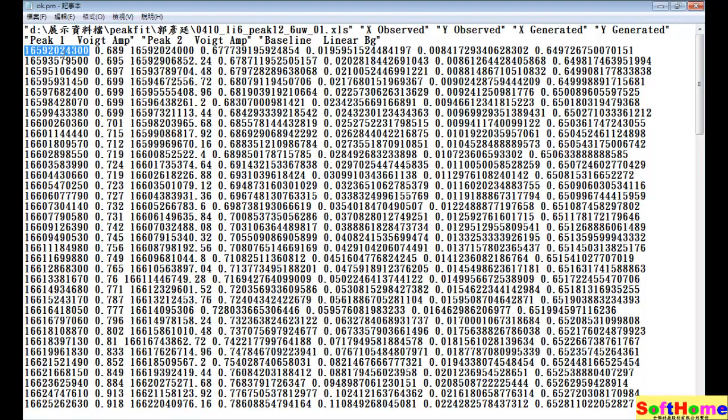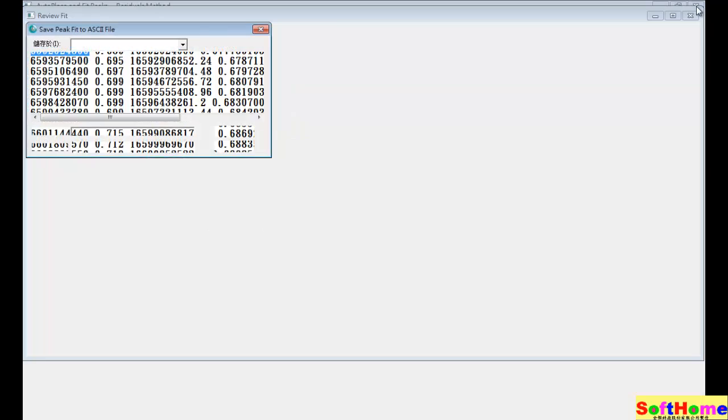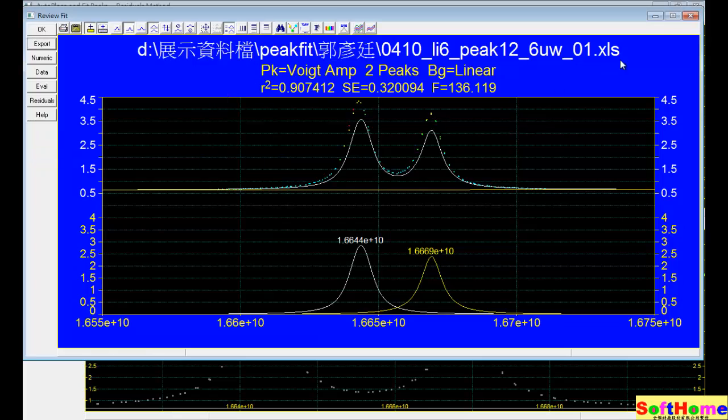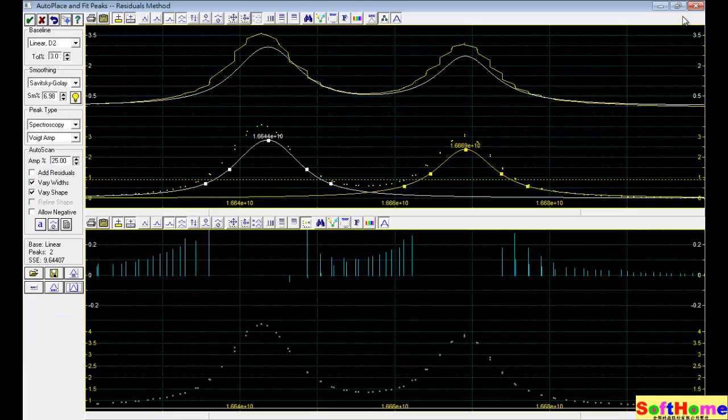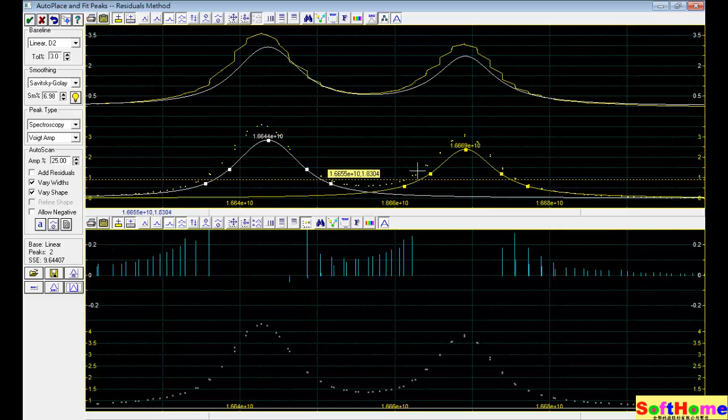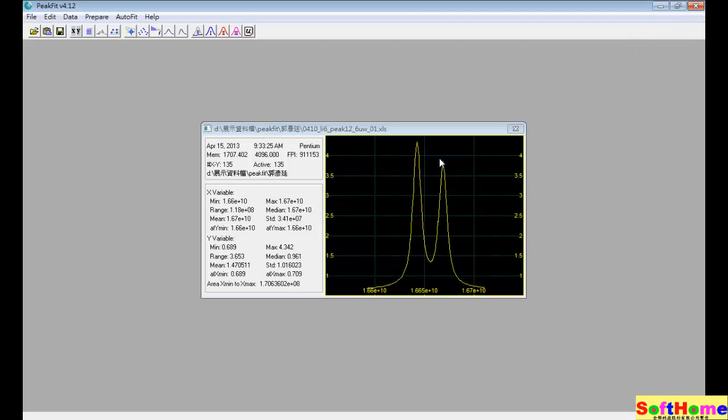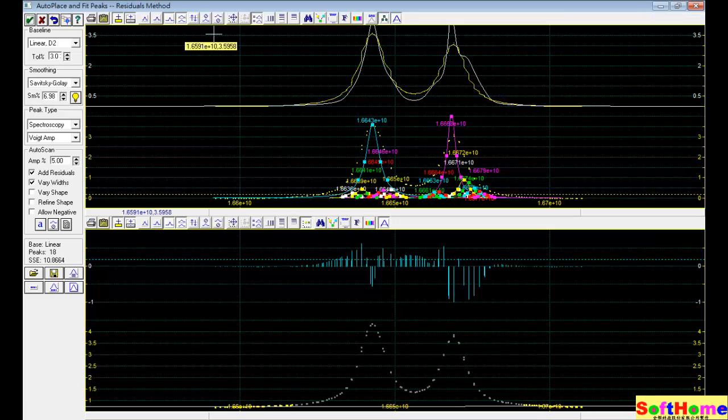And you can see the X. And they have two peaks. Use this automatic method. We can tune the R2 into quite close one. Very good.